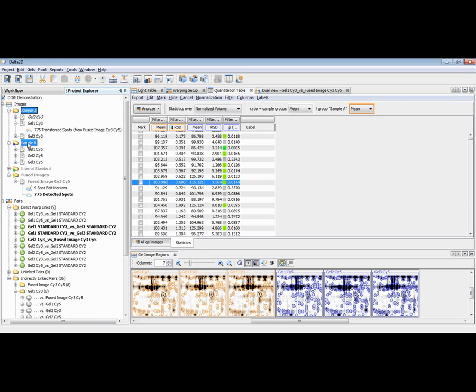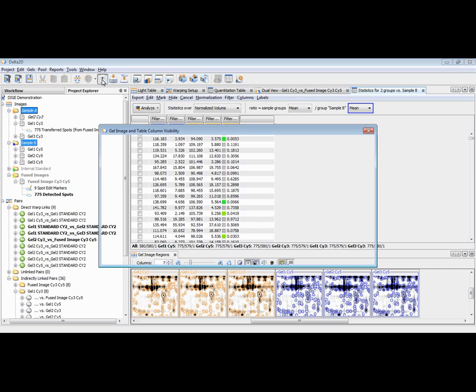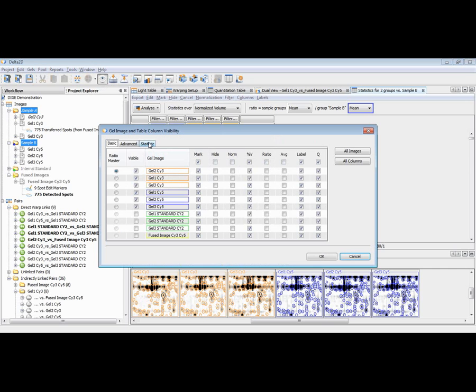So if you just select entire groups here and then press the quantitation table symbol in the main symbol bar, then we get a new quantitation table containing the groups that we have selected, with the first group that we have selected being the reference group for that. So all the p-values here and also ratios, I have hidden the ratios, sorry.